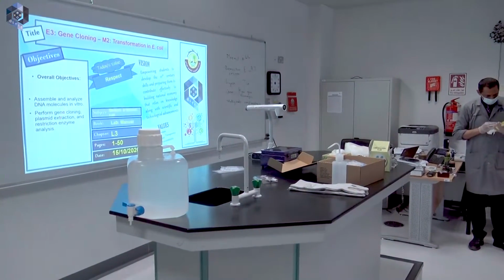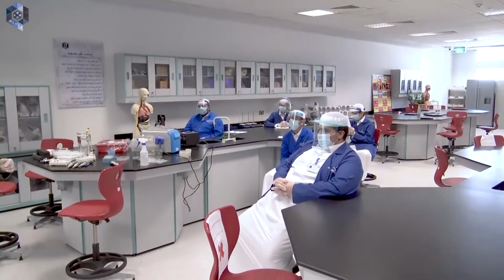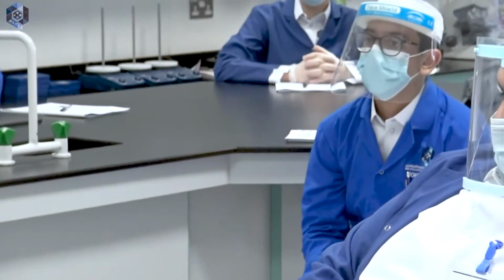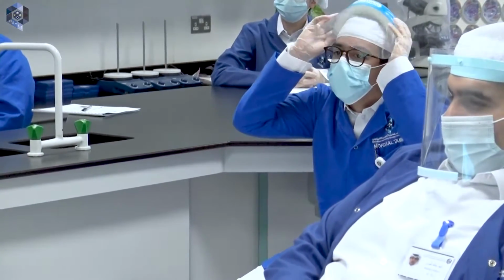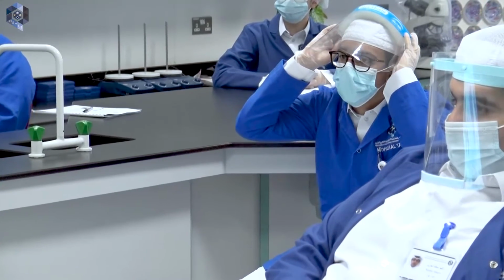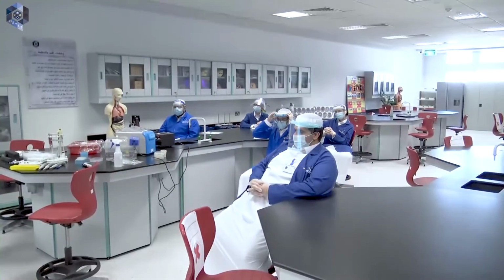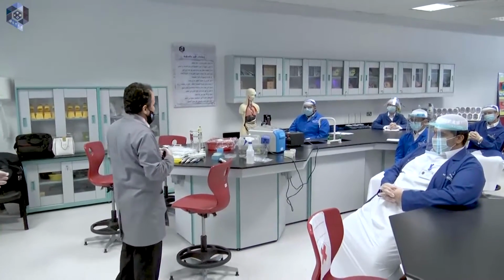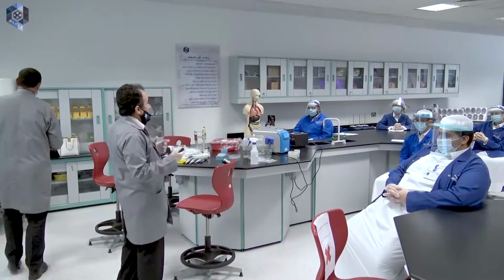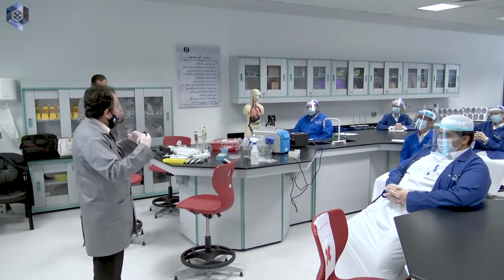And in today's lab we have two main objectives. Muhammad, can you please read the first objective? In vitro. Yes. Extraction and restriction enzyme analysis. Okay, these are the overall objectives of the experiment. We are going first to do a recombinant DNA plasmid, and this is what we did last week. This is what we did a week ago.